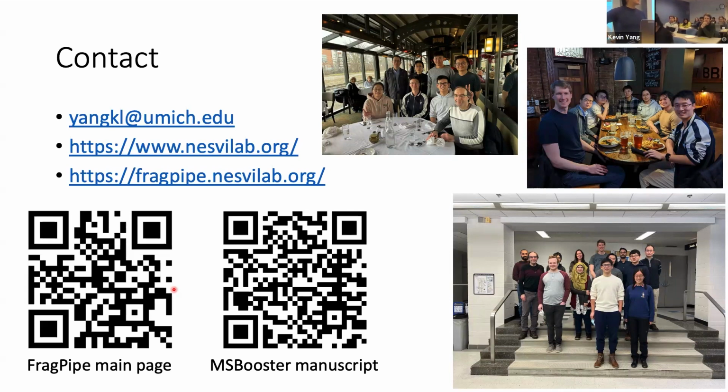Oh, yeah. So they try to be as diverse as possible, and a lot of them are publishing their training data sets along with it. The really cool use case, I think, is the Prosit team, because they have this wet lab that generates a lot of synthetic peptides, like millions of them, and those are all available online. And those span a wide range of normalized collision energies. They span different instruments. They have tryptic data sets, non-tryptic data sets, and a lot of PTMs that they're looking at specifically, like they synthesized 21 different PTMs. And so the idea is that they're as generalizable as possible.